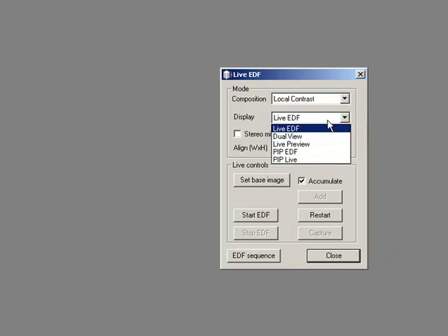I can do other things as well. I can do dual views live, I can do a live preview on one image while I do the correction on the other, but we're just going to do Live EDF for now.